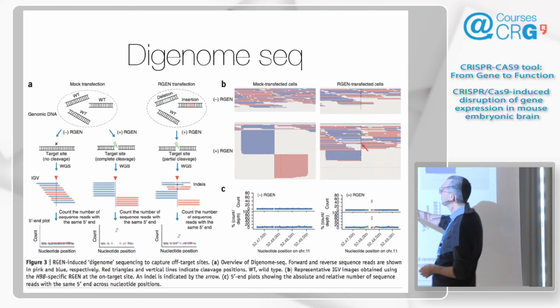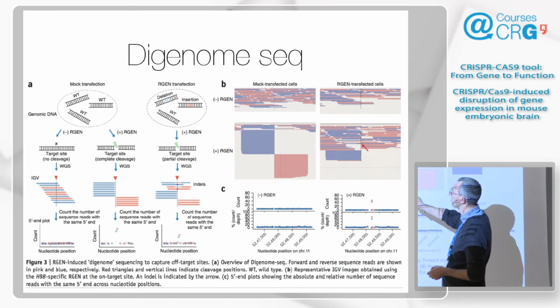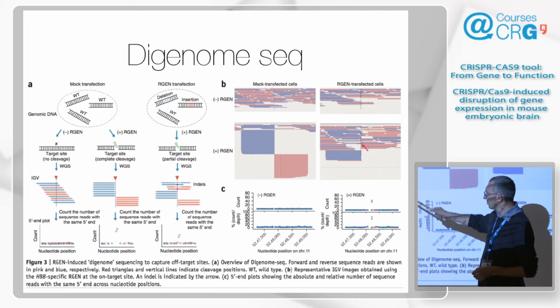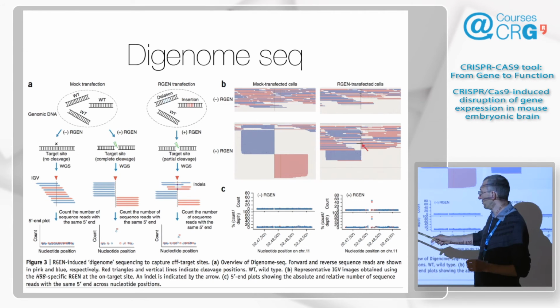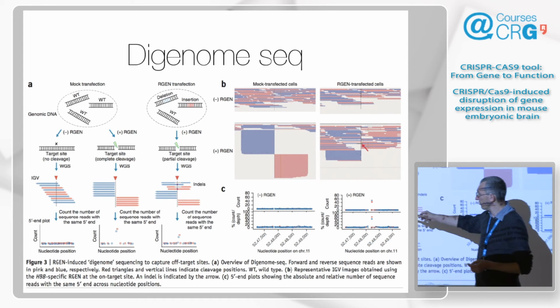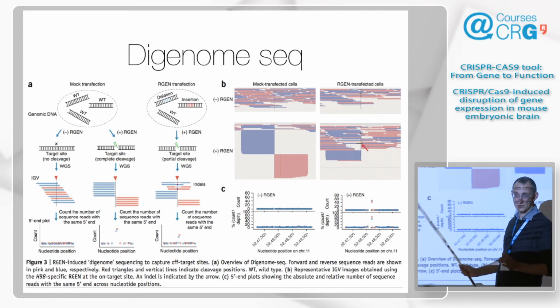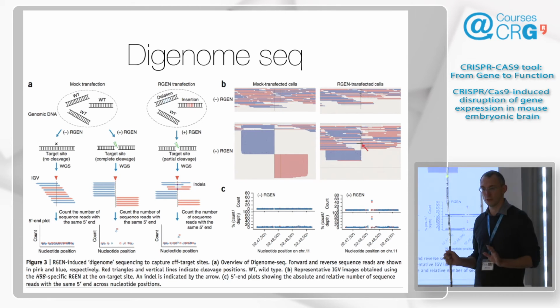So in your edits, you have, let's say, the insertion you want, and there will also be deletions and other substitutions. So when you cut wild-type sequence, you will have clean cuts at the position that's targeted by the guide. When you don't cut, you have basically no stacking of this sort. What's happening here? This here is Illumina reads. So, next generation sequencing.